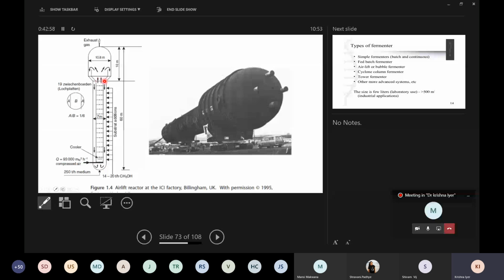Okay, and calculate the volume, and we'll look at the feel for that volume when we actually realize at what level we need things, at what level we need to aerate things, at what level we need to make sure mixing is turbulent, and so on and so forth.